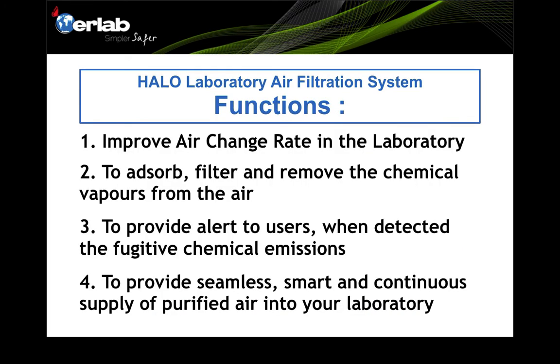The HALO laboratory air filtration system has at least four main functions. Number one, it improves the air change rate in the laboratory. Number two, it adsorbs, filters, and removes chemical vapors from the air. Number three, it provides alerts to users when fugitive chemical emissions are detected. Number four, it provides a seamless, smart, and continuous supply of purified air into your laboratory.